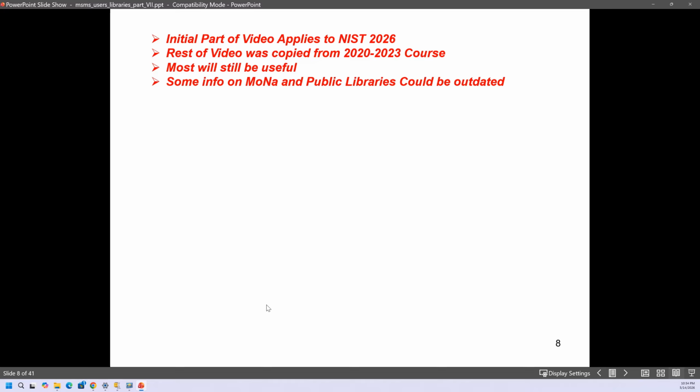So the initial part of the video applies to NIST 2026. The rest of the video was copied from the 2020 to 2023 course as it was in those years. Most of that in the latter 2020 to 2023 video will be useful, but some info on Mona and public libraries could be outdated. So I hope you find this useful, and I'll attach the other video right after this. Thank you. Good day.